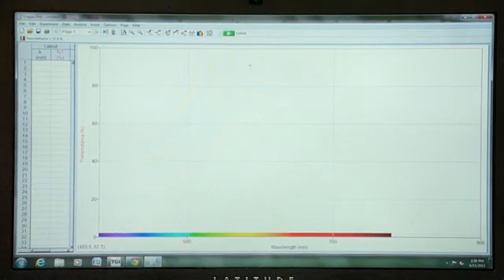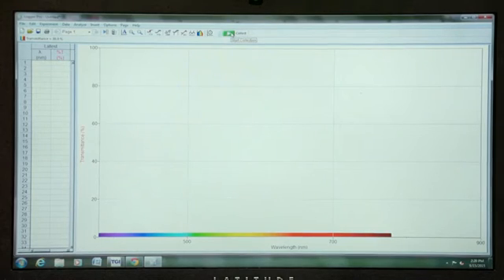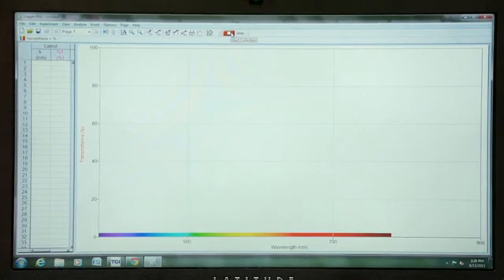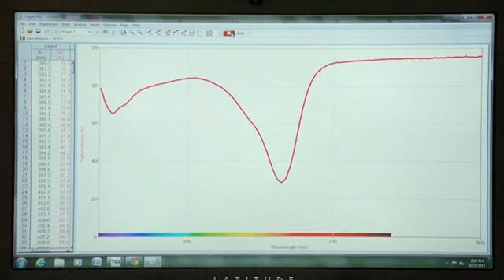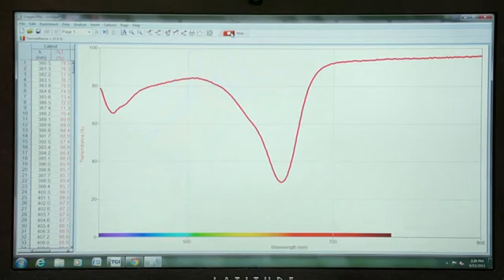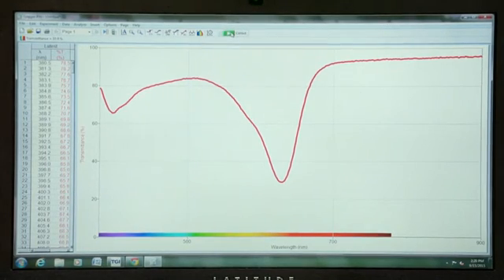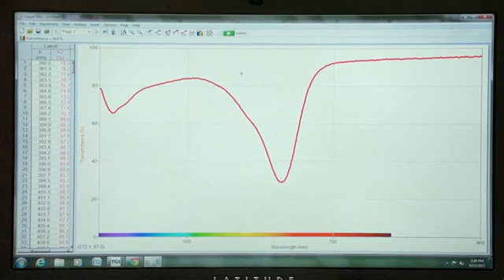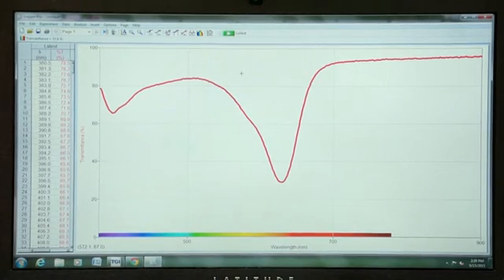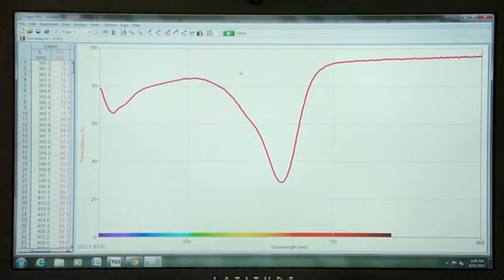Having done that, we will now begin the data collection by clicking the Collect button and notice that the process is complete rather quickly. Now we have a graph that shows us percent transmittance versus wavelength of our sports beverage.